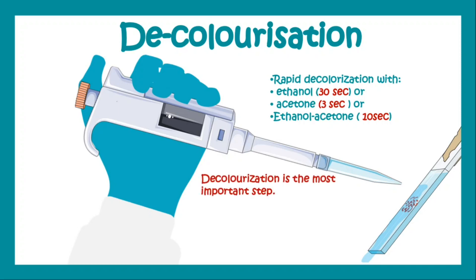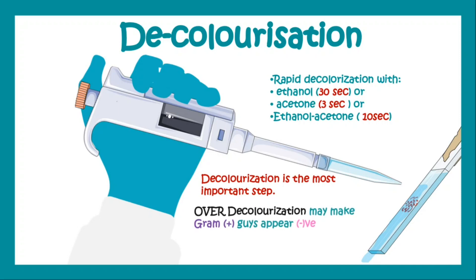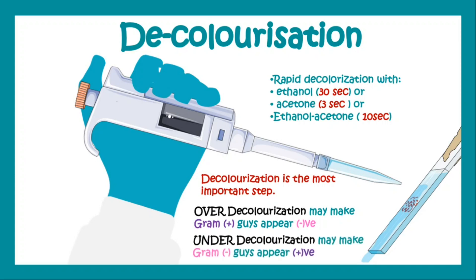Decolorization is the most important step of gram staining. If you do over-decolorization then even a gram-positive organism may appear gram-negative, and if you do under-decolorization then a gram-negative organism may appear gram-positive, which can lead to false diagnosis. So decolorization should be performed with utmost care and concentration.